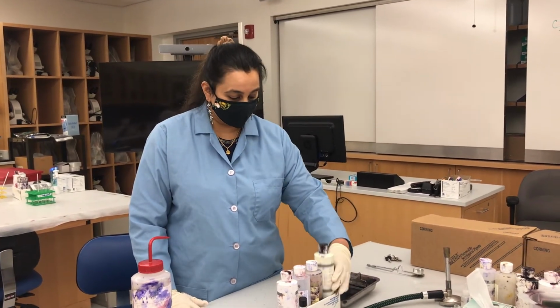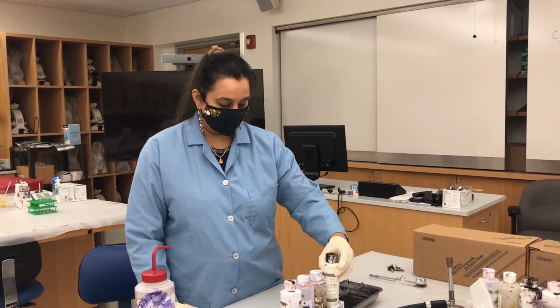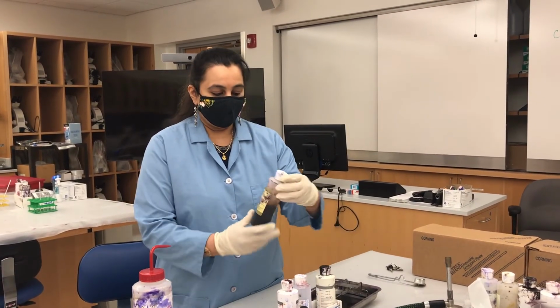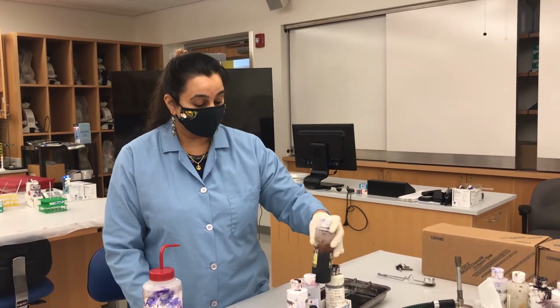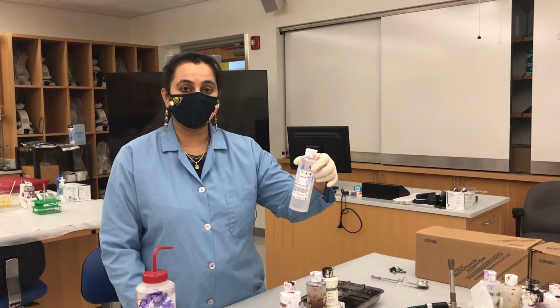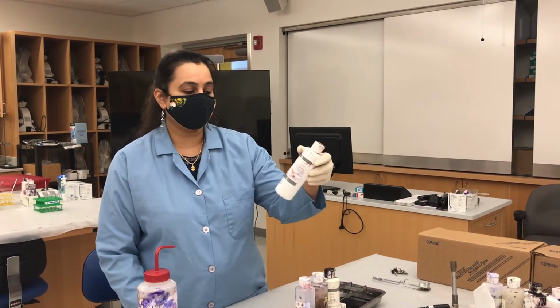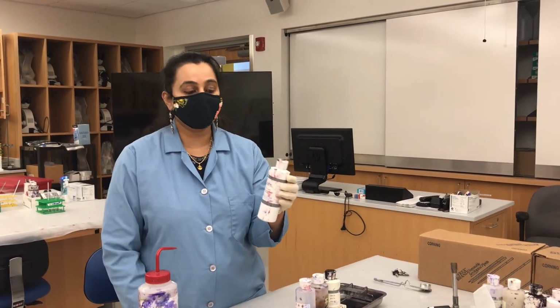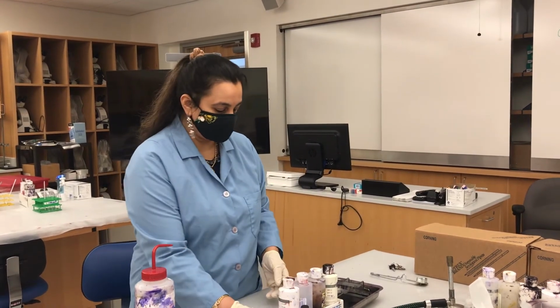So I have it right here, and I make sure that I have enough for my gram staining. The second reagent is Gram's iodine solution, and I do have it here. The third solution is the decolorizing agent. I do have it here. And the fourth reagent is the secondary stain or the counterstain, which is safranin, the pink stain.